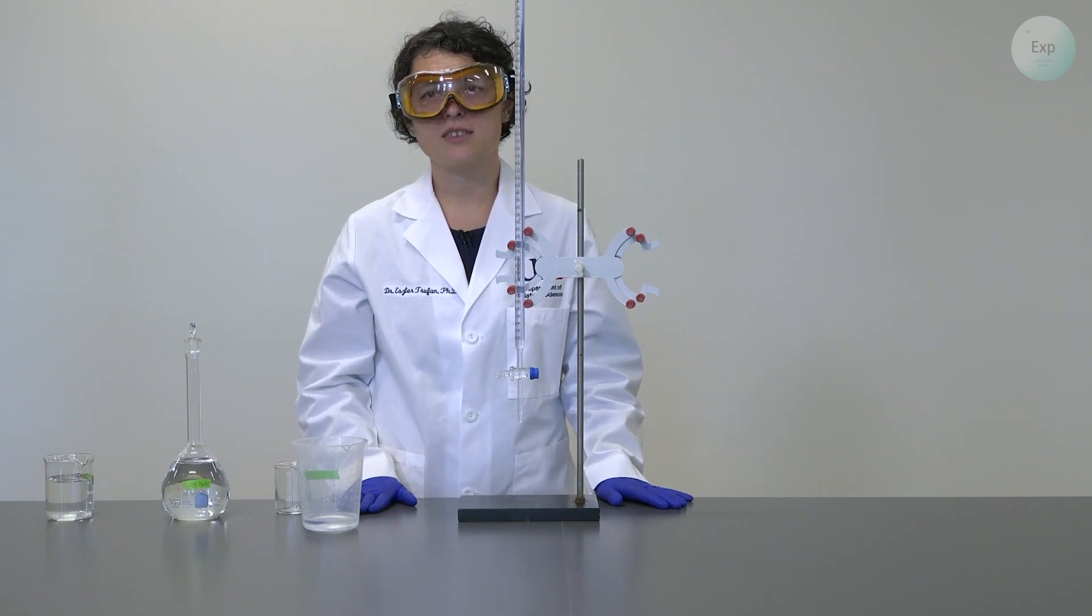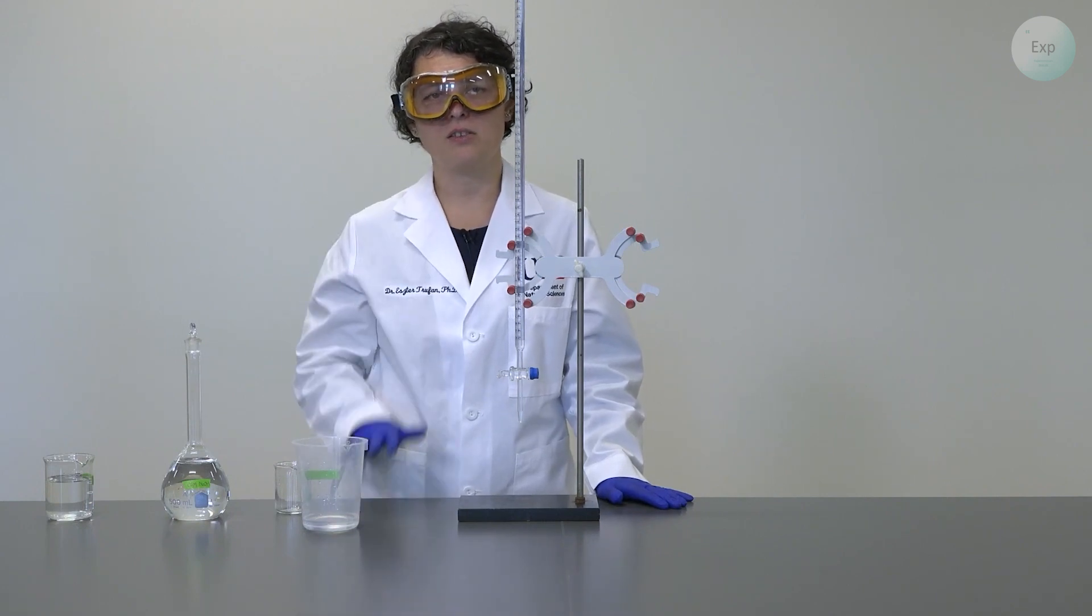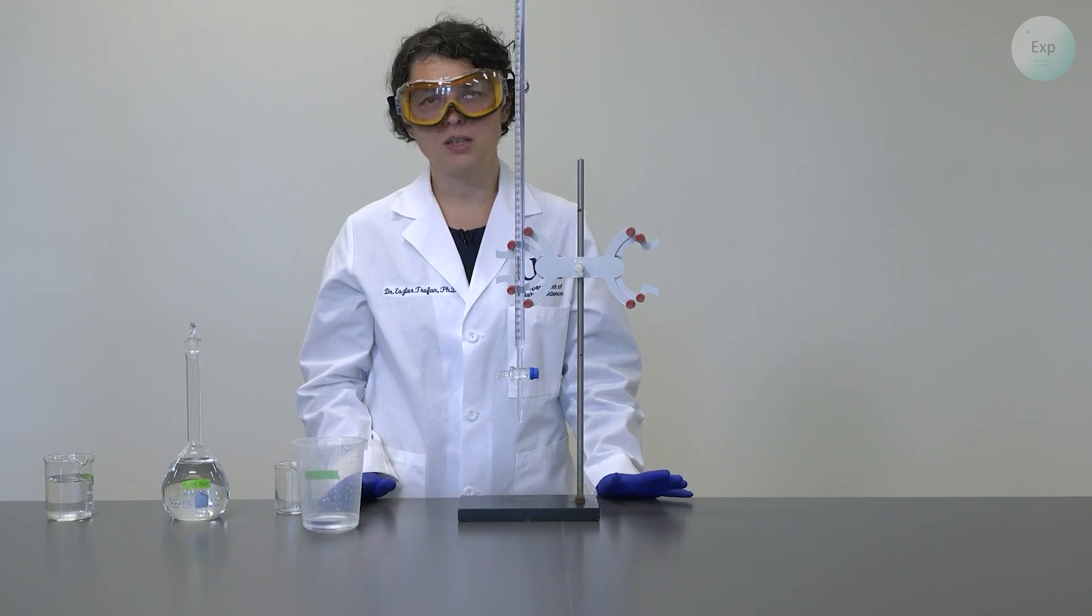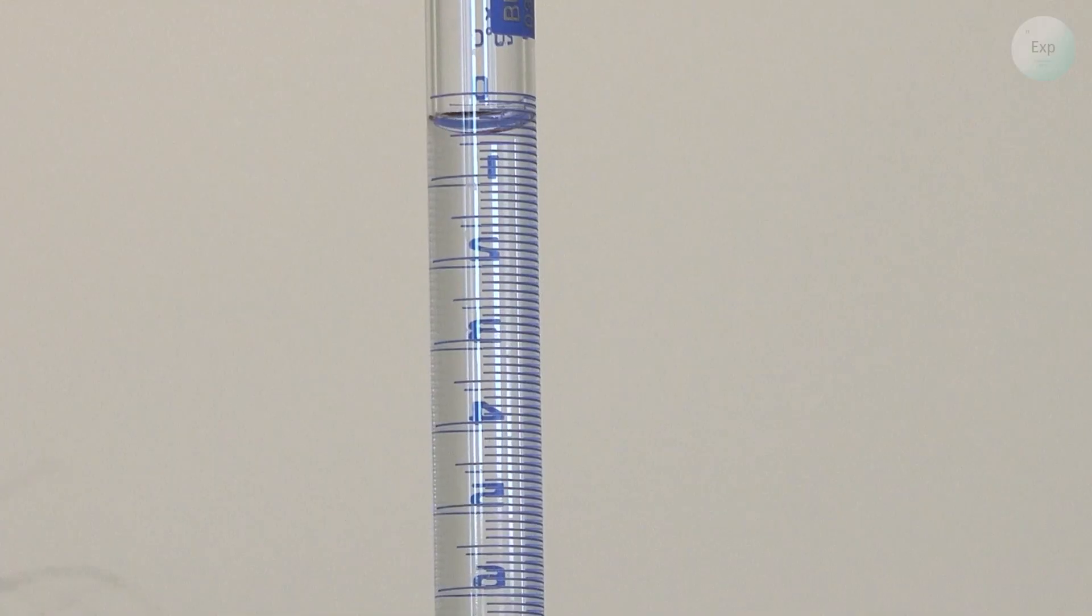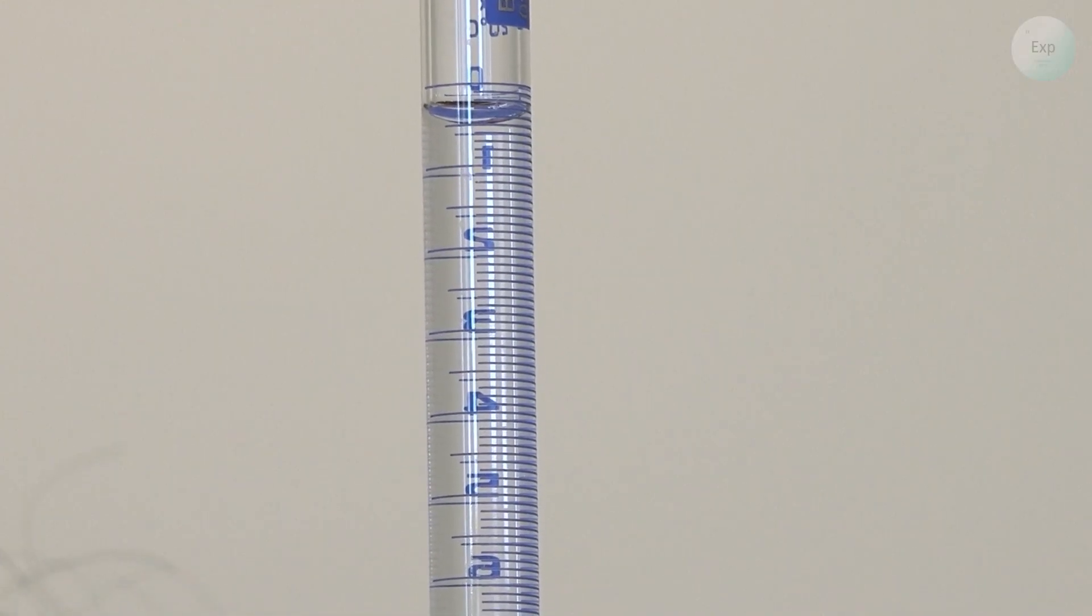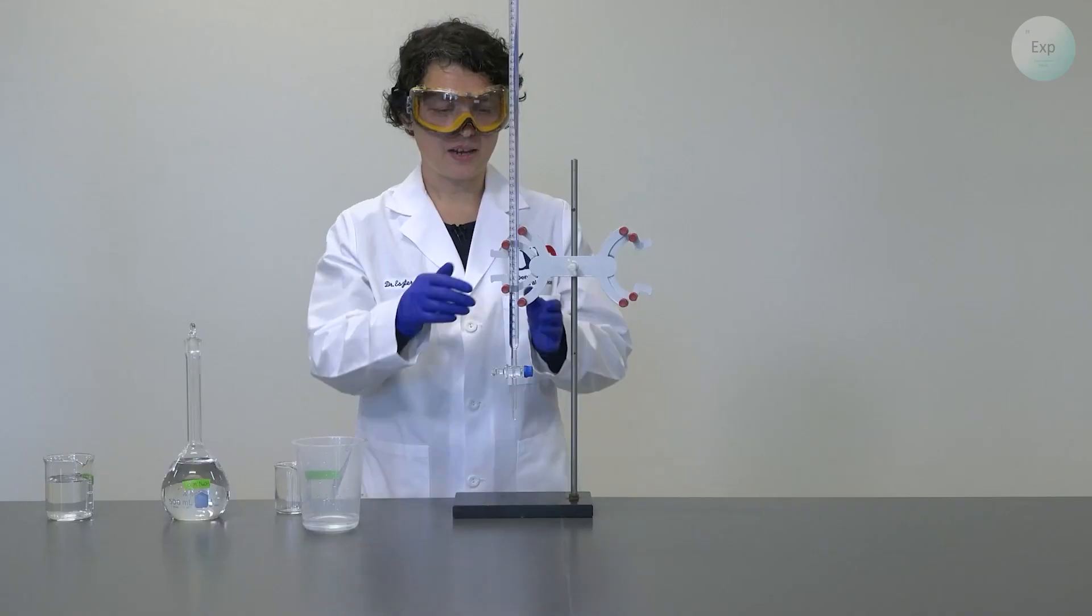The only difference between a burette and the 10 milliliter graduated cylinder is that in the case of a 10 milliliter graduated cylinder, the zero is on the bottom and the 10 is on top. Whereas in most burettes, with the exception of the very few, the zero is going to be at the top and the 50 or other number will be at the bottom.